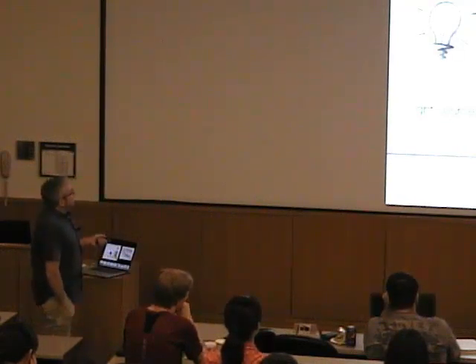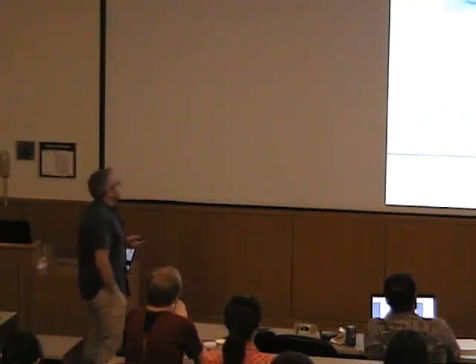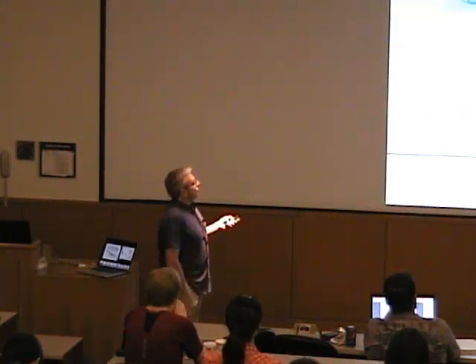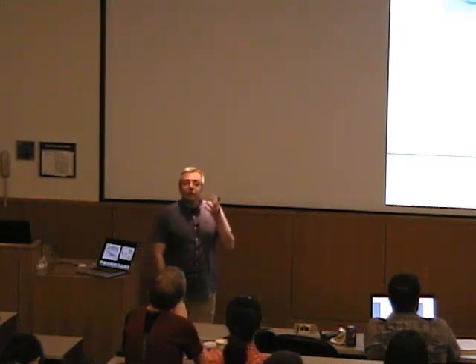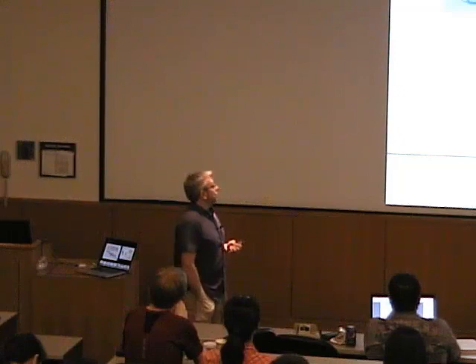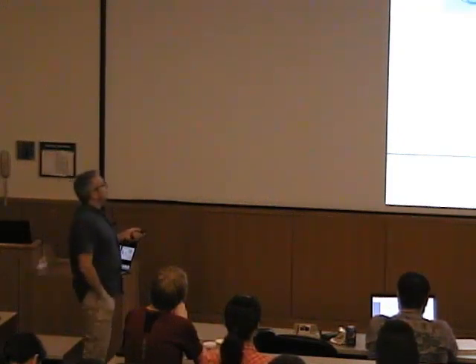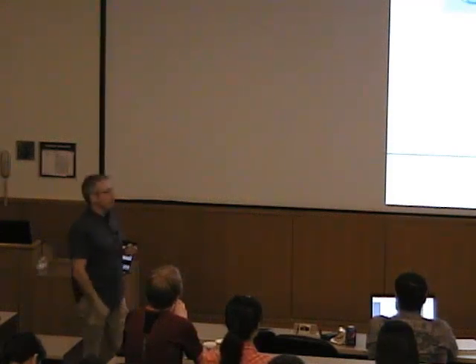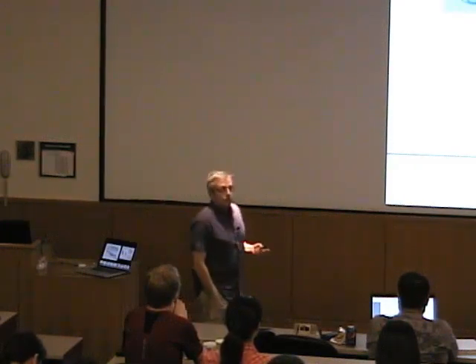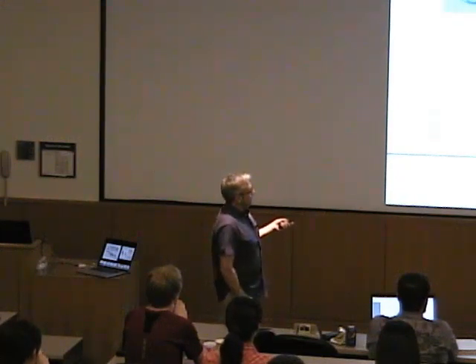Now, of course, we're not looking at bacteria, but we want to look at molecules, and you all know what that means. It means that we have to adjust the wavelength that we use to the size of that part of the object that we would need to know. If we say we want to do microscopy, then of course this would not be possible with light microscopy, even with super resolution light microscopy. That is very prominent these days, but it would well be possible with electron microscopy.